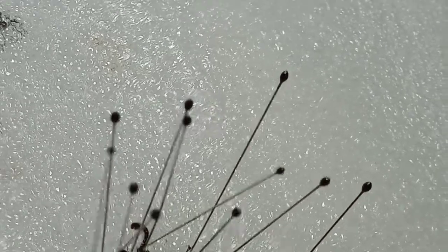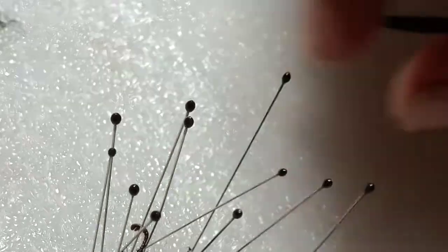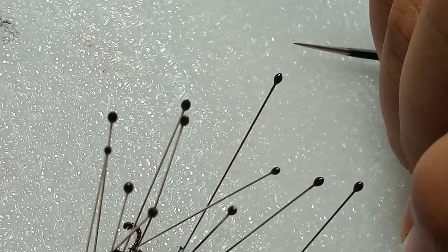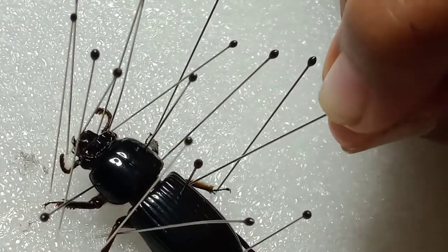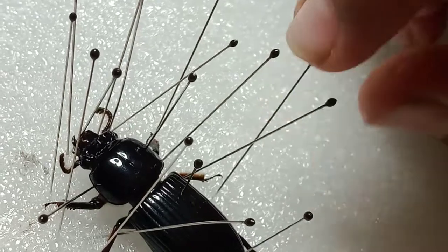Let it dry for three to four days. The way you can tell if it's all dry and stiff is that you take one pin out and move the leg real gently. And if it's all hardened, that means it's all ready to go to add to your insect collection.